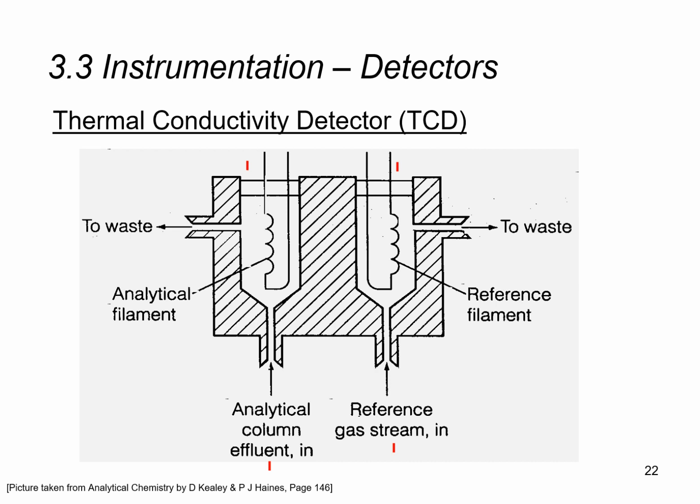So imagine if nitrogen gas is constantly filling the chamber on the left. Nitrogen gas has a certain thermal conductivity, which means that it is by nature able to conduct heat a certain way, right? Which means that if over time only nitrogen gas is filling this chamber, then the wire filament in the left chamber will be maintained at a constant temperature.